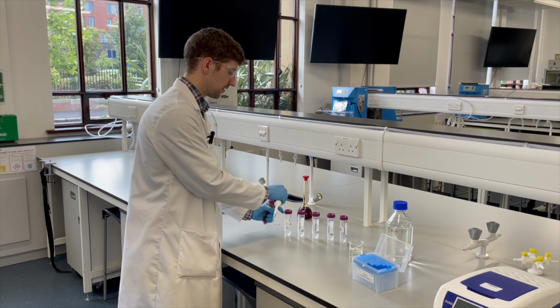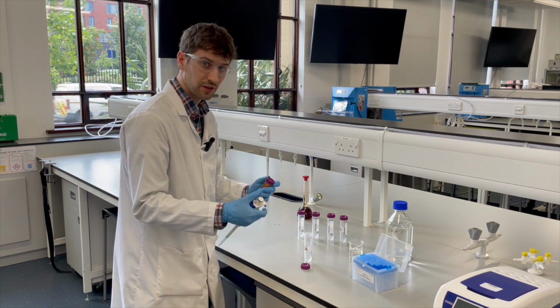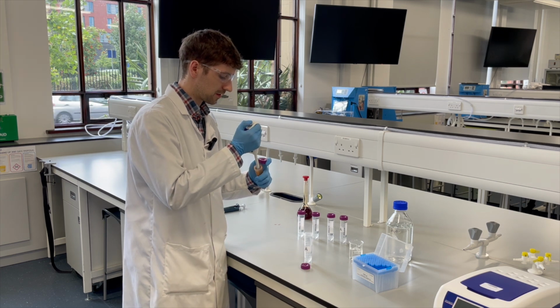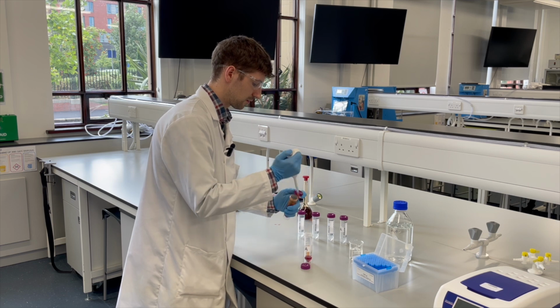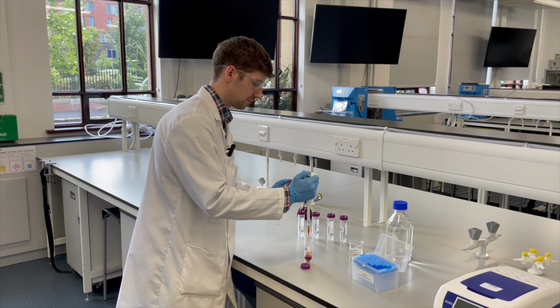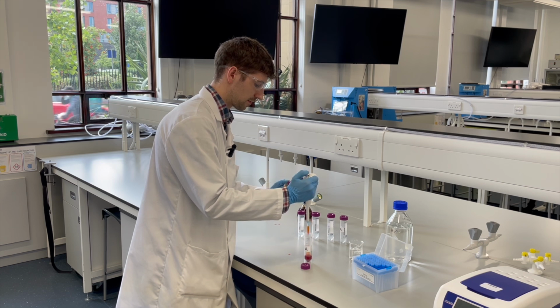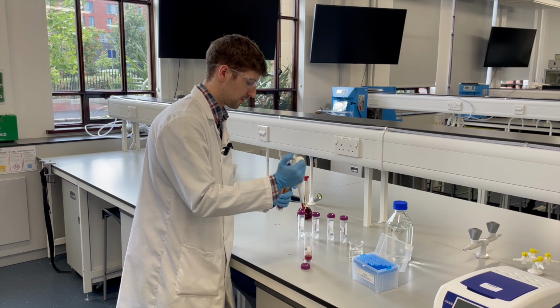So let's see how that looks like. So if I've put 4 mils of blank or diluting agent into this, of course, to do a 1-in-1, I'm going to need 4 mils of concentrated stock. 1, 2, 3, 4.